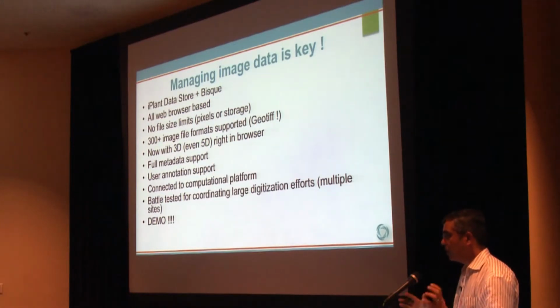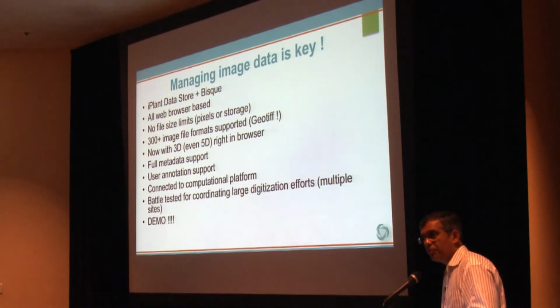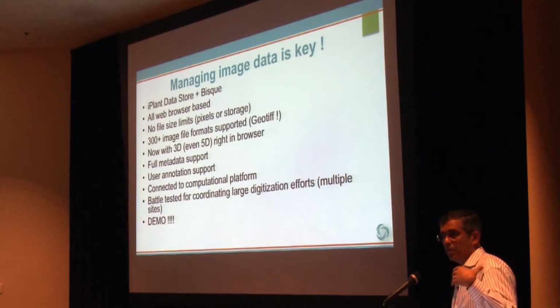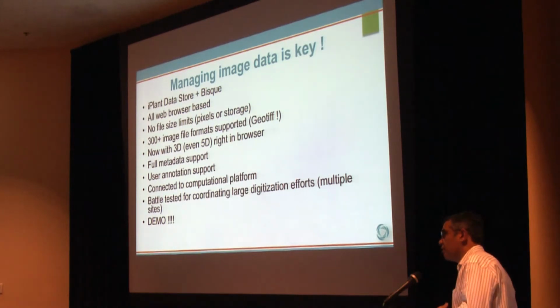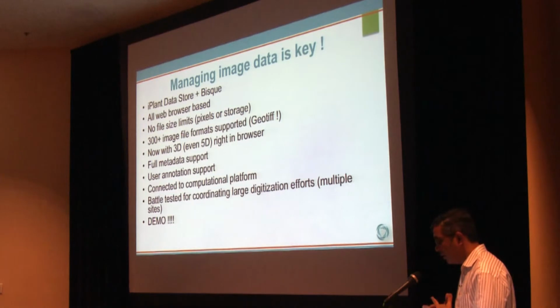The rest of them convert that into a movie because nobody knows how to work with the complex software. And we wanted to make sure we made it really easy for people to work with 3D and go beyond 3D. When you start working with data that has multi-dimensional data but is an image format, how do you combine that? Whether it's temporal, it's different frequencies, it's different wavelengths that are encoded into the image. So I'll show that to you today.